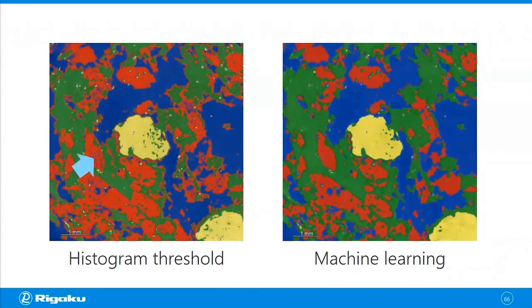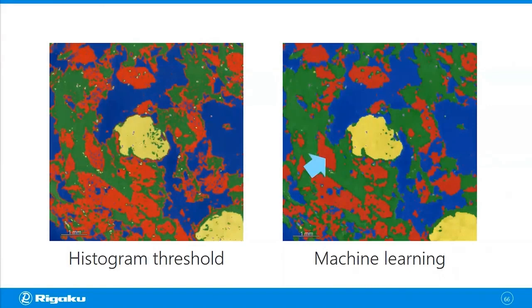And other than this kind of framing artifact, you also can get rid of those noise-like speckles. You don't have those in the machine learning segmentation.